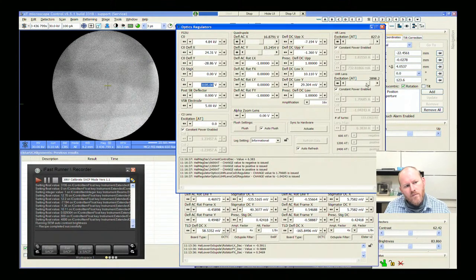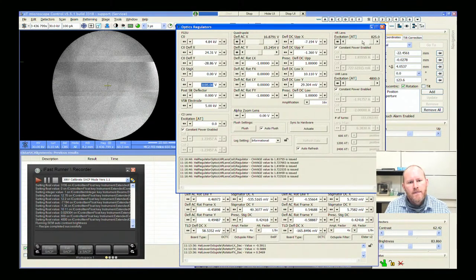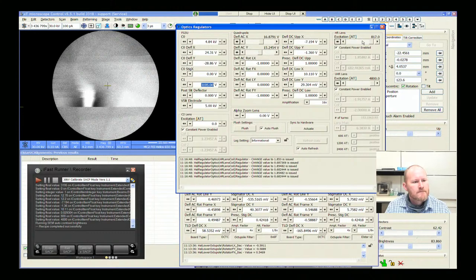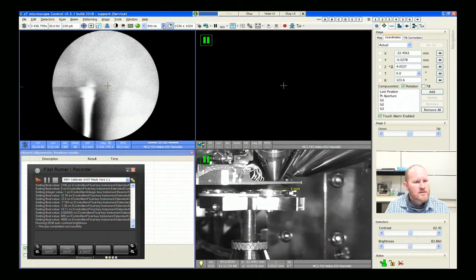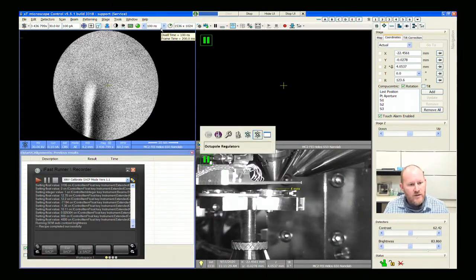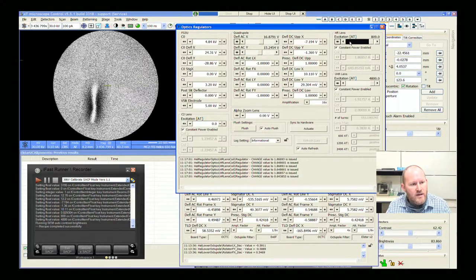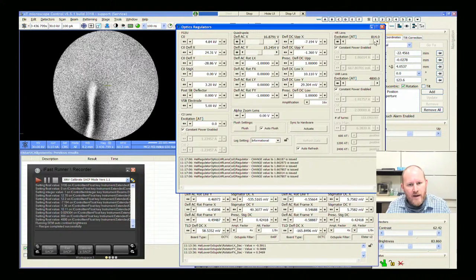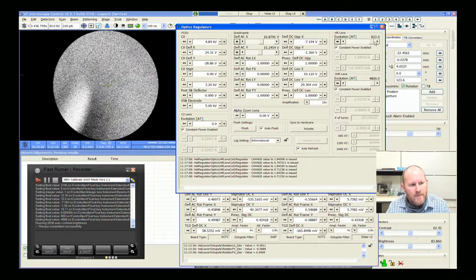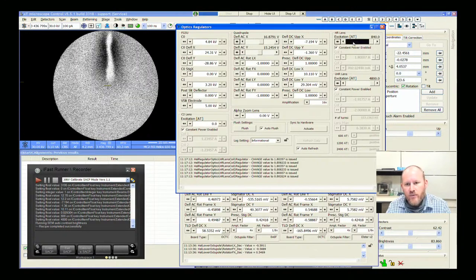Using what were the objective lenses, we now use the objective lens to bend the beam back to a rocking point — so we scan the beam off axis, enter the objective lens, and that bends the beam back to the rocking point so we can see a pattern. The UHR lens and high resolution lens: I'm actually not looking at the patterns now — what I want to see is this feature exit the field of view in the bottom left and re-enter in the top right, which is an indication that we've gone through the pivot point.